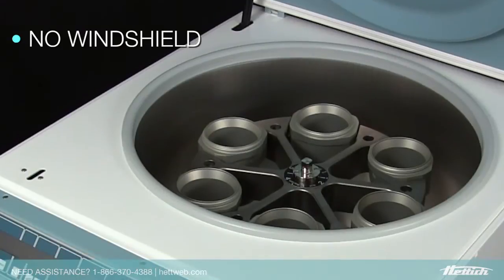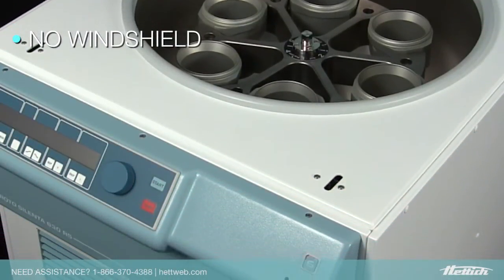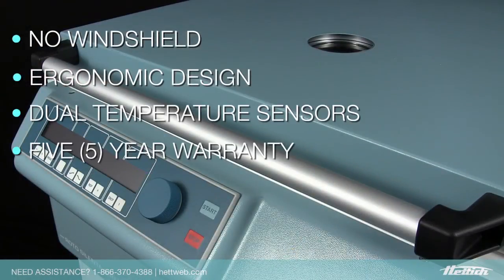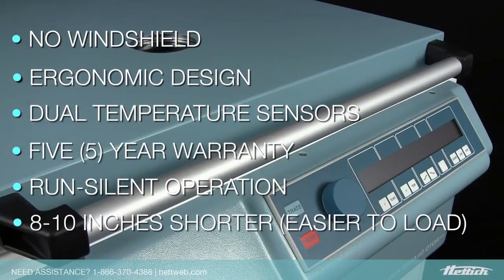Unlike many of our competitors, there's no windshield to be taken on or off at the end of each cycle. Ergonomic, simple design, dual temperature sensors, a 5-year warranty, run-silent operation, and the unit is about 8 to 10 inches shorter than many on the market.